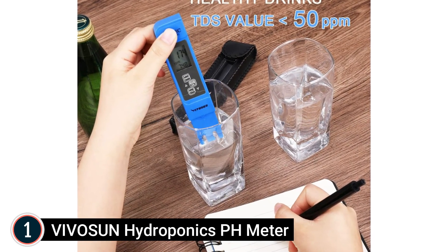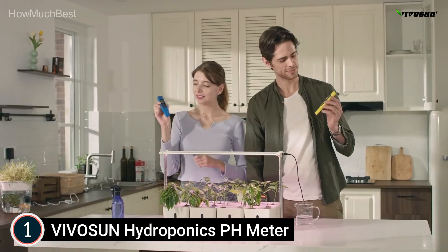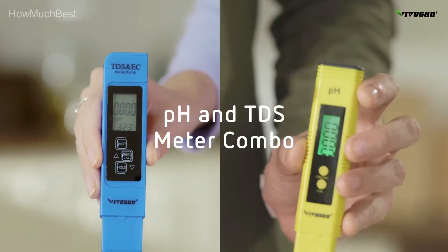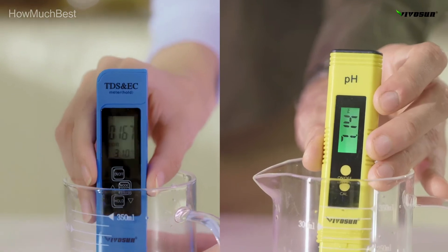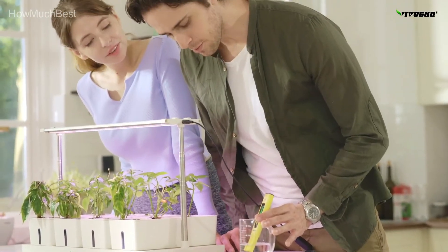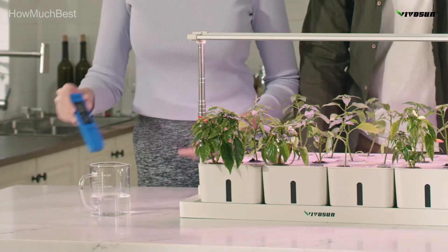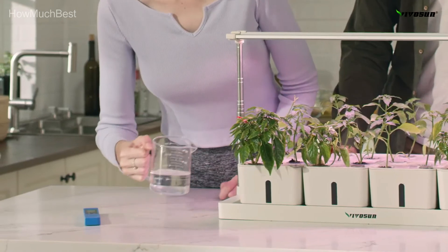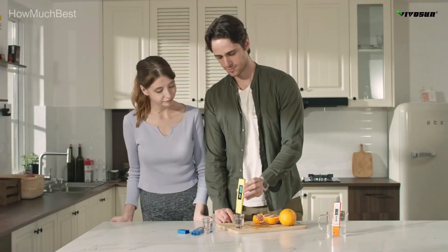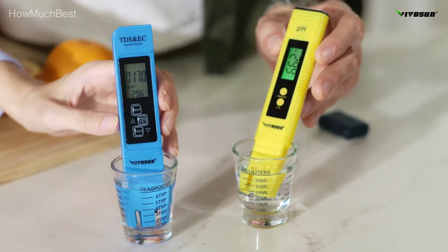Lock feature makes it easy to read and record — the tool will lock the reading result after the numerical result gets stable. Press the hold button, then remove the meter from the test solution to read. For display modes, press the shift button to cycle through: TDS ppm and °C, EC µS/cm and °C, TDS ppm and °F, EC µS/cm and °F. 9-minute auto turn-off feature so the battery won't drain. Vivicine pH and TDS meter is ultra precise, reliable, and easy to use.